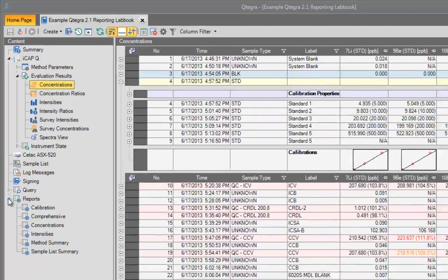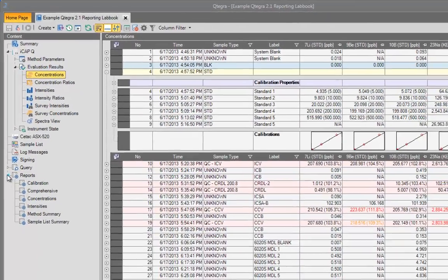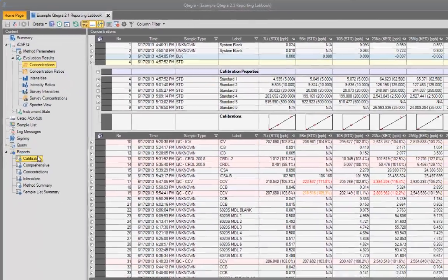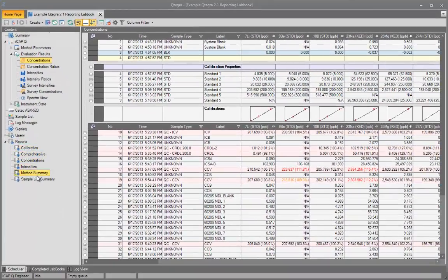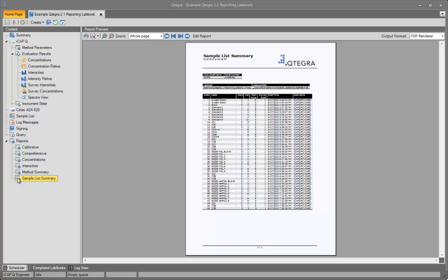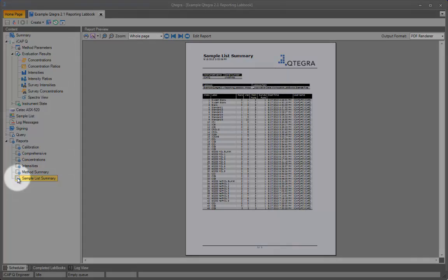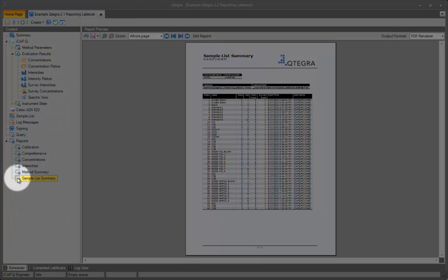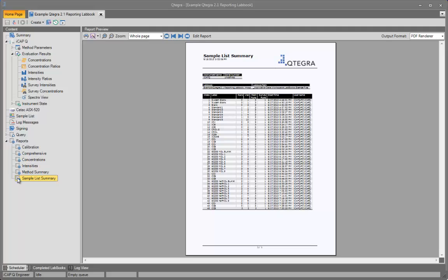Each template can be applied to the current labbook by just selecting it from the list. So if I click the supplied report sample list summary, for example, the template is applied to the open labbook, populating the report, which is then displayed in the main window here.